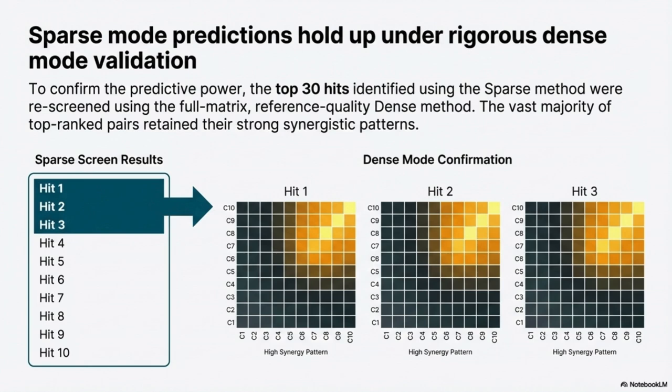So we've got the hardware, we've got the software. What's the actual workflow like? It's broken into 3 phases. Phase 1 is the single agent screening. You run each drug by itself across its 10 doses. And that data is only generated once. Only once. It's not remeasured for every single pair. You just map it computationally later on.